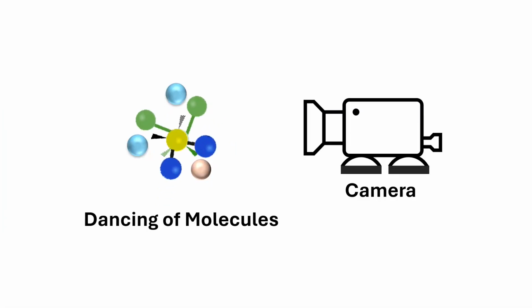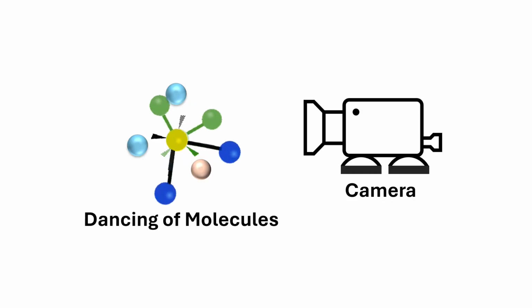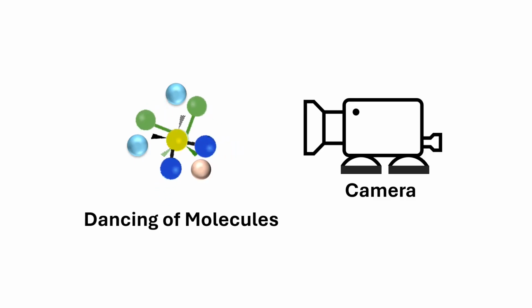In simple terms, I could explain the FTIR. Molecules in a material are dancing, and the FTIR is the camera that records the dancing moves. Our eyes cannot see the molecules in a material, however the FTIR machine can. It can see the vibration of the bonds in functional groups in a molecule. It is a molecular fingerprint scanner. I am going to explain more step by step.